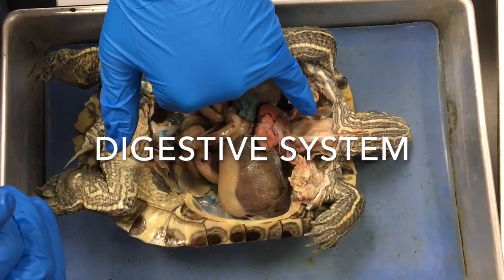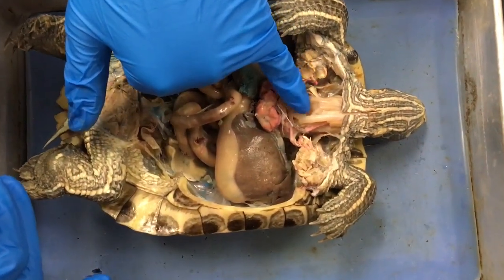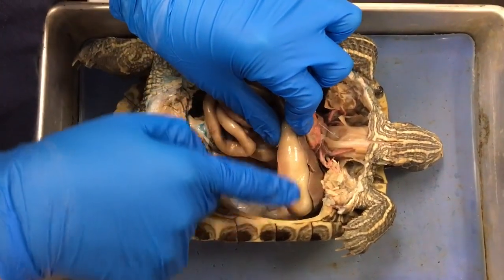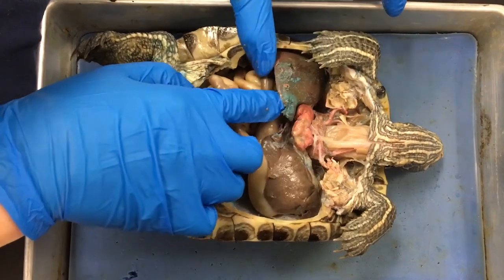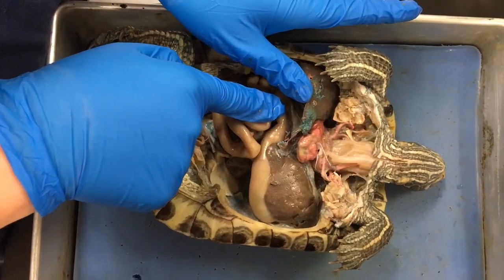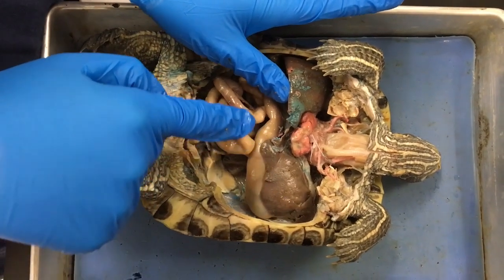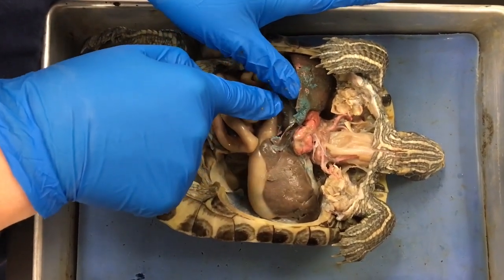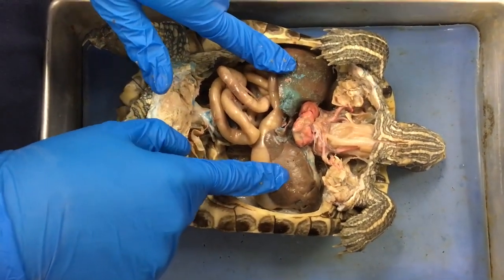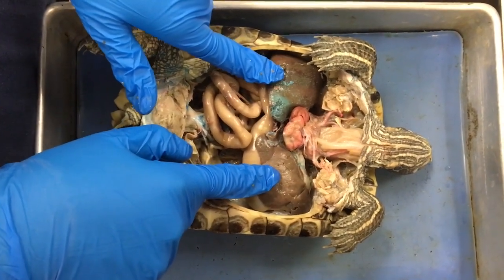The esophagus delivers food to the stomach from the mouth — it is smooth, muscular, and dorsal to the trachea. This part is the stomach, which secretes acidic juices to break down food. The pancreas is up under the liver and is the major gland of the digestive system; in turtles it has an appearance similar to the mammalian spleen. The pancreas secretes digestive juices made of water, electrolytes, and enzymes into the small intestine. The liver metabolizes carbohydrates and fats and serves in bile pigment and cholesterol production.